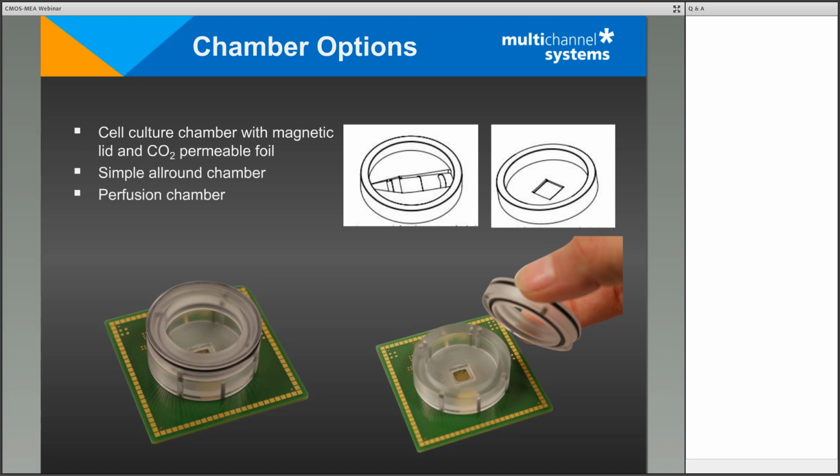As I said, I have no personal experience yet what the stimulation strength has to be. However, most of this system is based on the work of Fromherz in Munich, and he also used slices and organotypic slice cultures on the CMOS arrays, and they work pretty nicely. Especially the organotypic slices work pretty well. But I'm very curious to see how acute slices will behave on the CMOS chip myself. Okay, thank you.